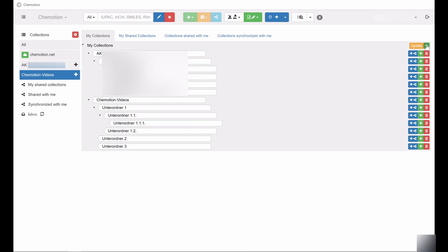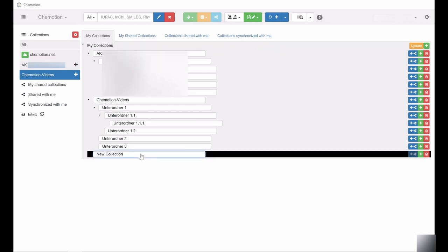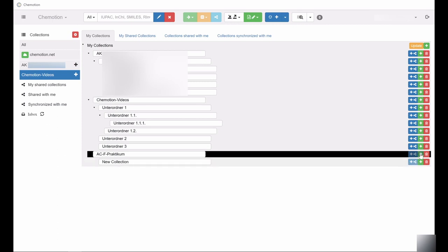Within the Collection Management window, new collections can be added by clicking on the green plus symbol on the right-hand side. To create new subfolders, click on the plus symbol next to the selected collection.